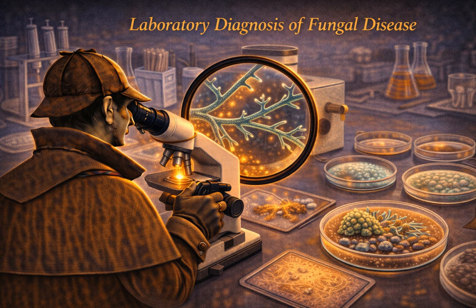They do H&E, hematoxylin and eosin. But Murray explicitly says H&E isn't enough for fungi. H&E is the standard pink and purple stain for all human tissue. It shows the architecture of the human cells beautifully, but fungi can easily blend right in.